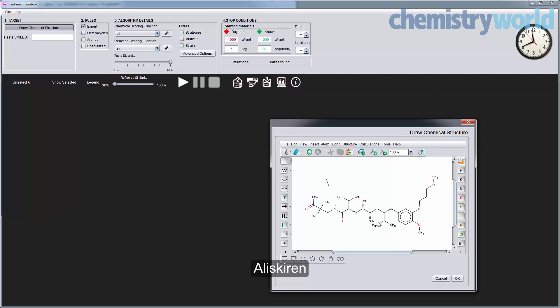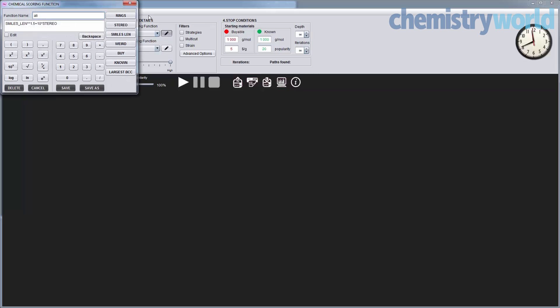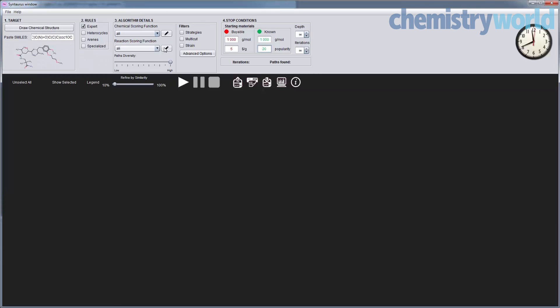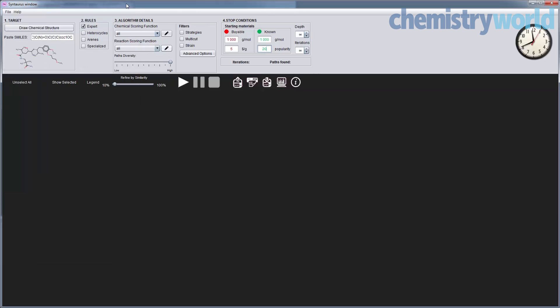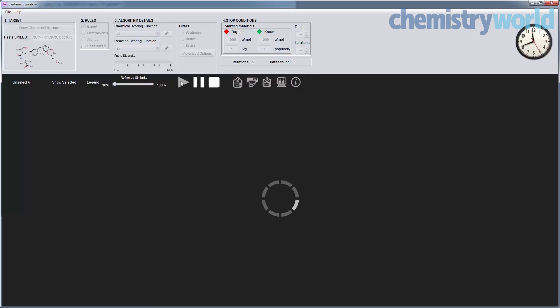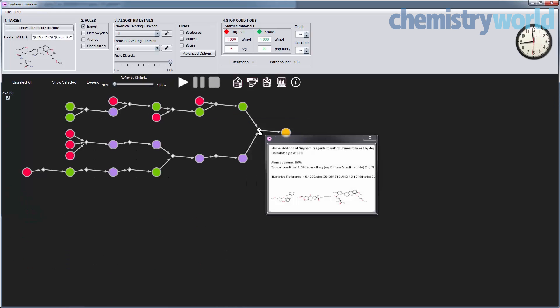Here's another target: aliskiren. This is a drug. What we're doing here is setting the scoring functions. This one gives preference for creating stereocenters. This one scores the reactions — fewer steps is better, more elegant steps is better. The red and blue are the stop points where the algorithm is supposed to stop: viable or known molecules. After the allotted time, we produce a synthetic plan that we think is actually pretty cool.